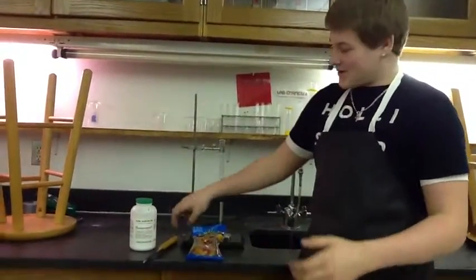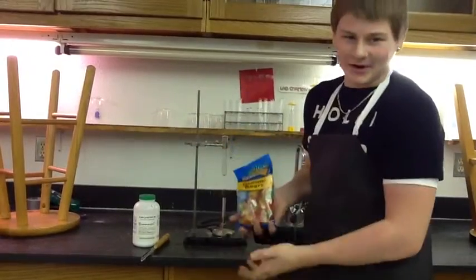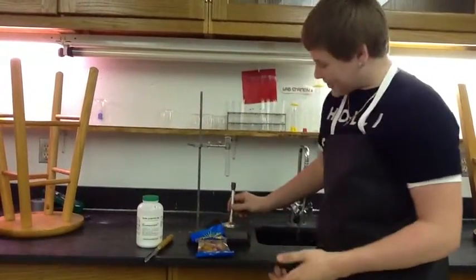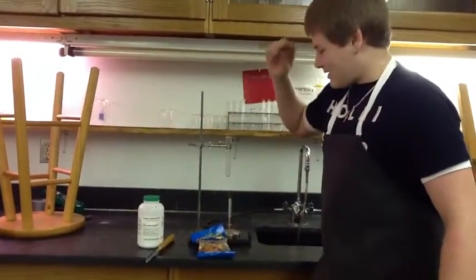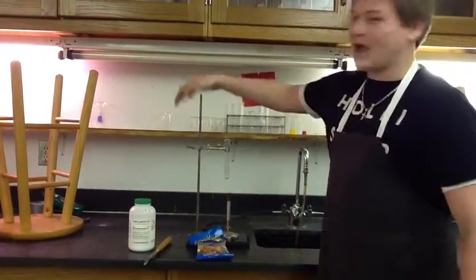For this experiment, you're going to need a spatula, gummy bears, a Bunsen burner, a test tube holder, potassium chlorate, and a lab stand.